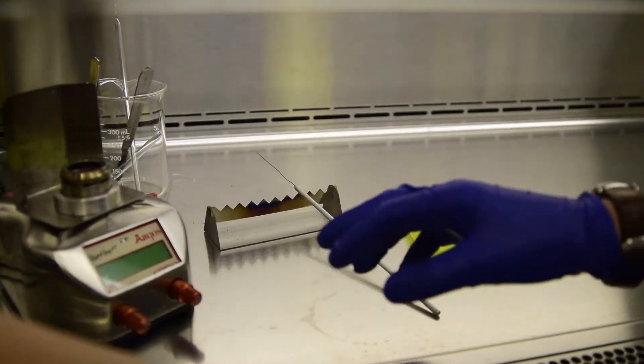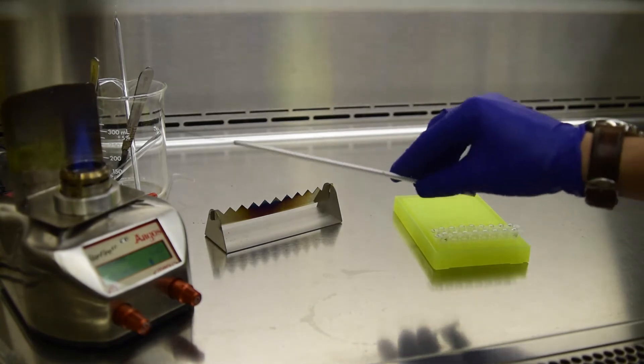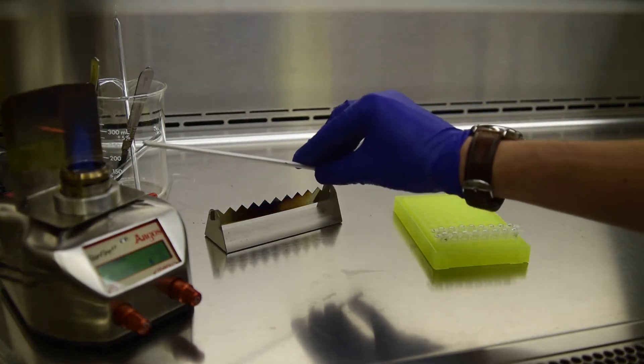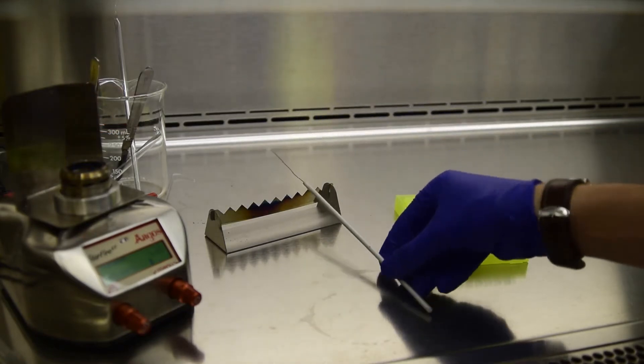Clean your hood workspace and flame your instruments. I like to use a needle or wire because it is quick to sterilize, but forceps also work. I transferred the strips to a rack that is also acceptable to use in the culture room hoods — one that is not for PCR. You should also wear gloves for this step.